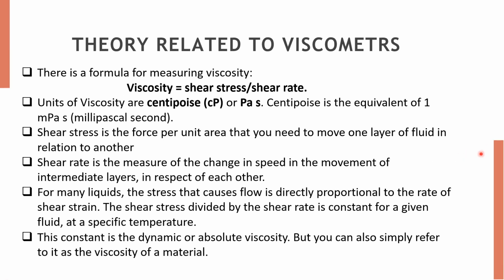Now we will see theory related to viscometers. There is a formula for measuring viscosity, that is it is the ratio of shear stress to shear rate, where shear stress is the force per unit area that you need to move one layer of fluid in relation to another, where shear rate is the measure of change in speed in the movement of intermediate layers in respect of each other. The units of viscosity are centipoise or pascal second.